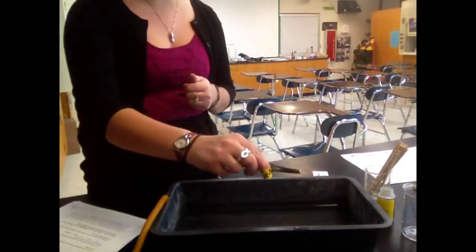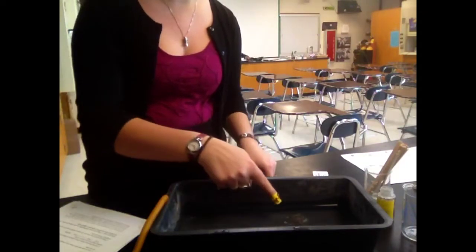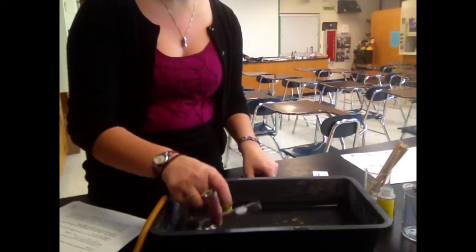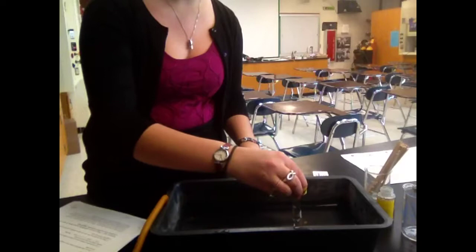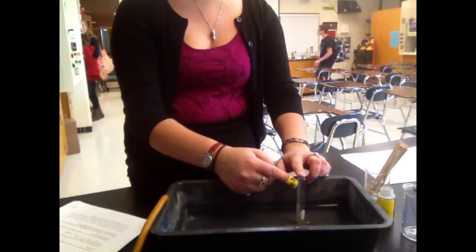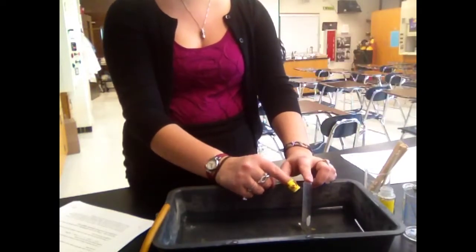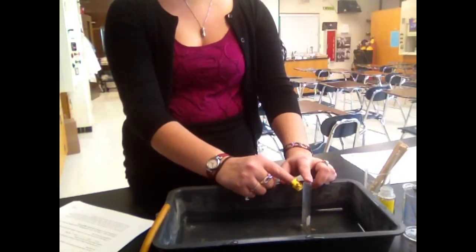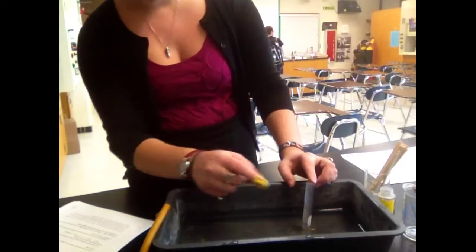And so I'm going to put this piece into water, and you start seeing some bubbles. And so I'm going to take these filled test tubes while underwater and put it over the calcium carbide piece. And as it's over the calcium carbide, the gas is going to start filling this test tube, pushing the water out of the test tube.